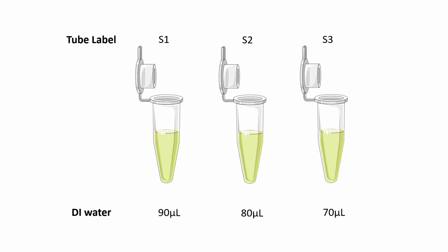In this manner, we can build our known collagen concentrations, and once we measure the absorbances of these concentrations, we can build our collagen standard curve. Once we have our collagen standard curve, we can use it to convert our absorbances for our samples into collagen content for our gel samples.